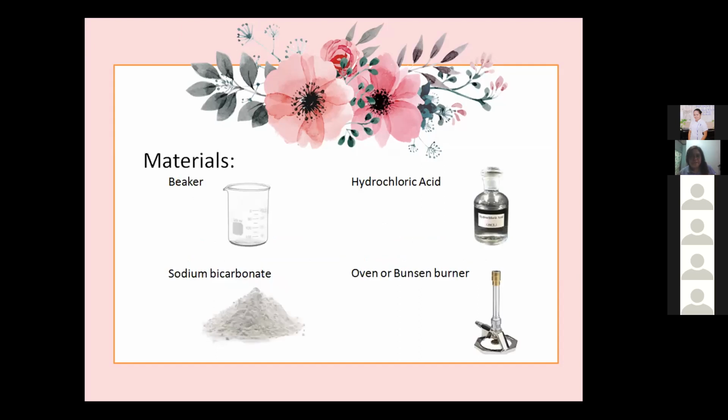The materials needed for this activity are the beaker, sodium bicarbonate, hydrochloric acid, and an oven or Bunsen burner.